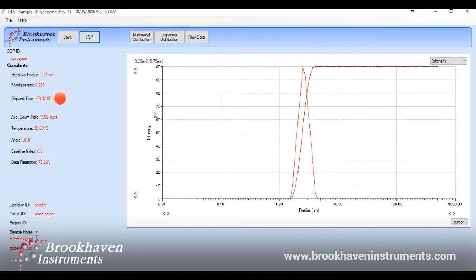With this filter, the large population peak disappears entirely, and the size drops down a bit to 2.31 nanometers.